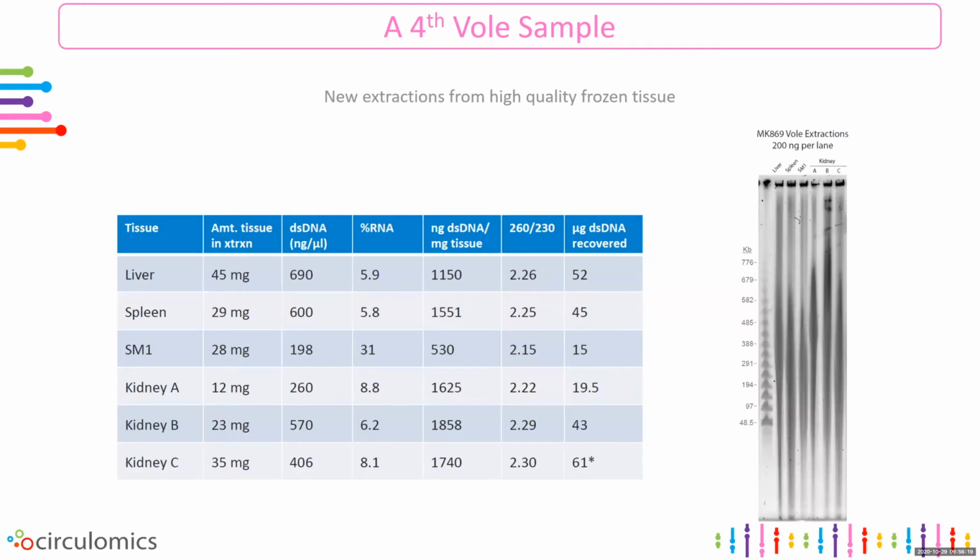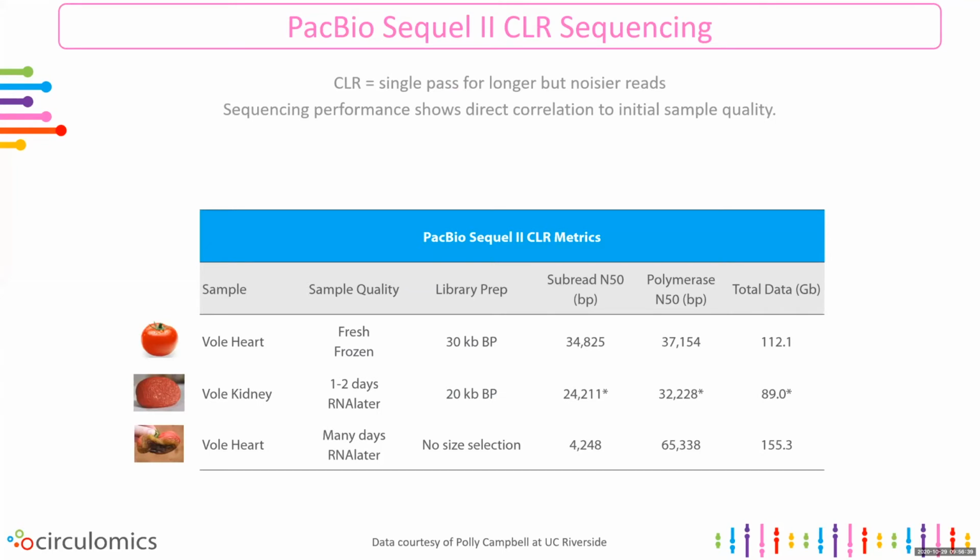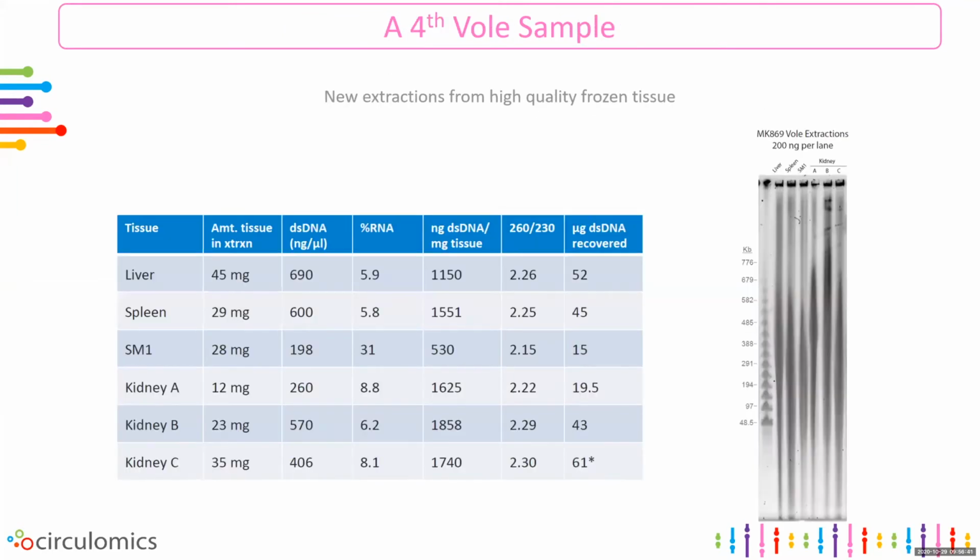Recently, about 6 months later, that group came back again, and they wanted to sequence a fourth Vole sample. This again was a high quality sample. Fresh frozen tissue is available. So again, we asked them for 4 different tissue types. We had liver, spleen, skeletal muscle, and kidney. You can see from the gel and from the pulse field data on the right here that all of these generated quite nice extraction results, good purities, good yields, good DNA size. So in the end, they actually chose to sequence the kidney sample.